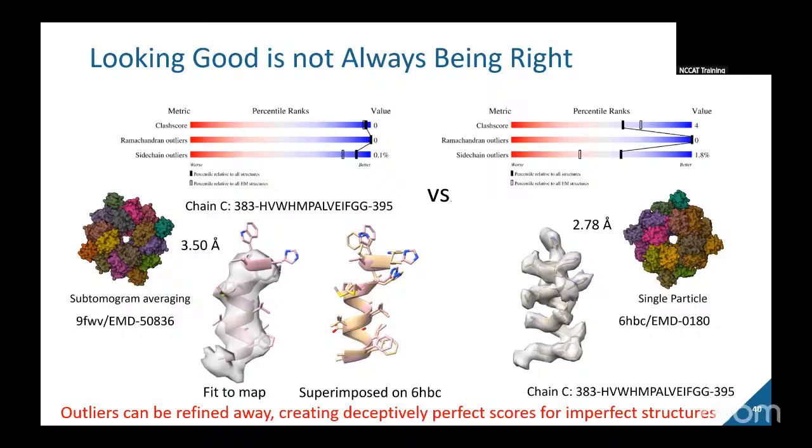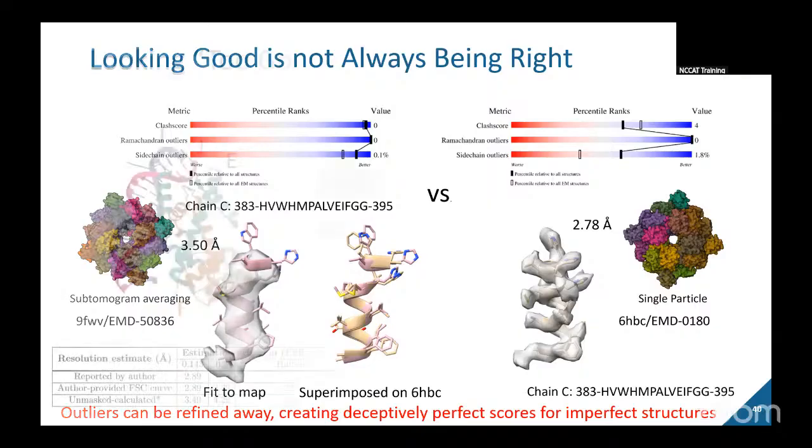And so we want to try and avoid this as much as possible. It can be challenging at times, but really, overfitting is something to always have in mind. And to help spot this issue, we did recently add the Q-score slider to the quality metrics. And this makes it easier to compare models fit against structures at a similar resolution or against the whole archive. And I'll have more to say about that in a couple of slides.